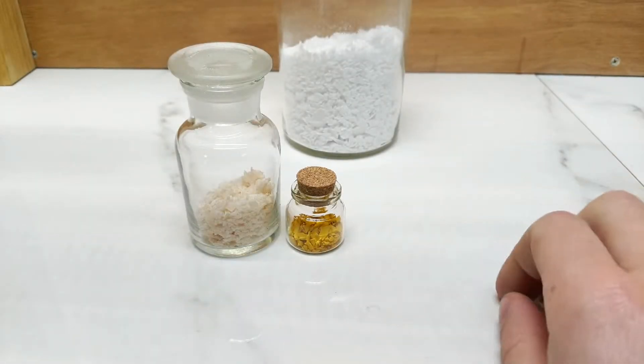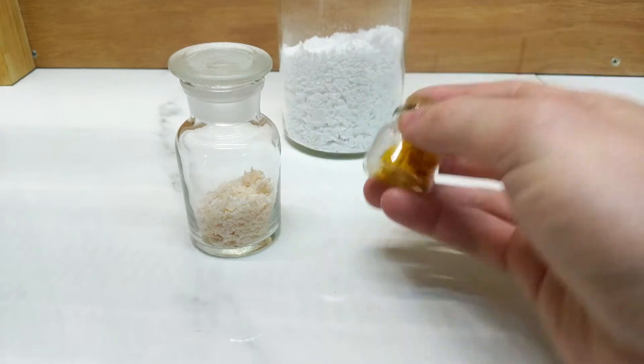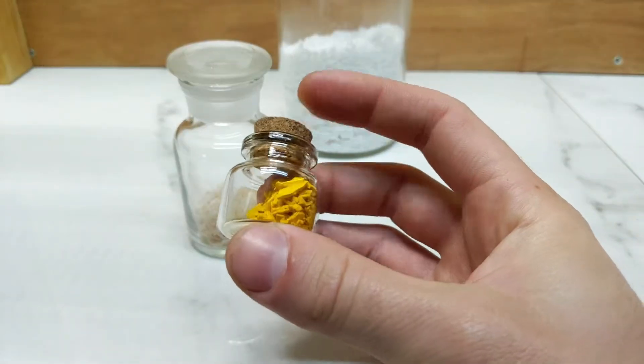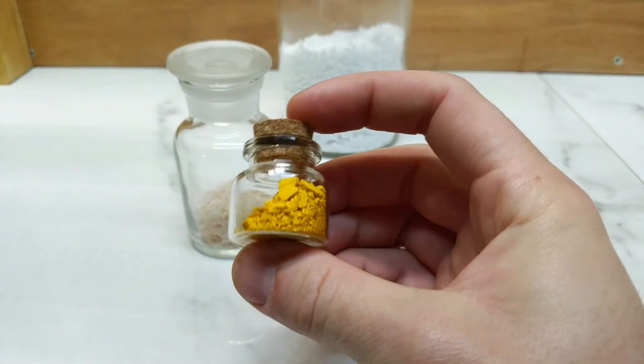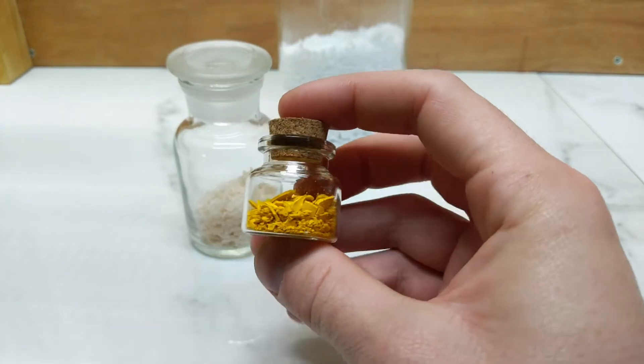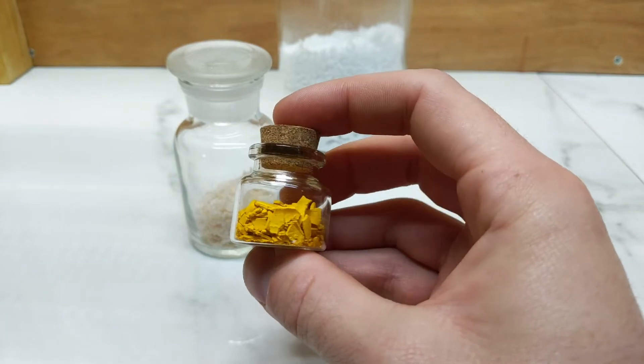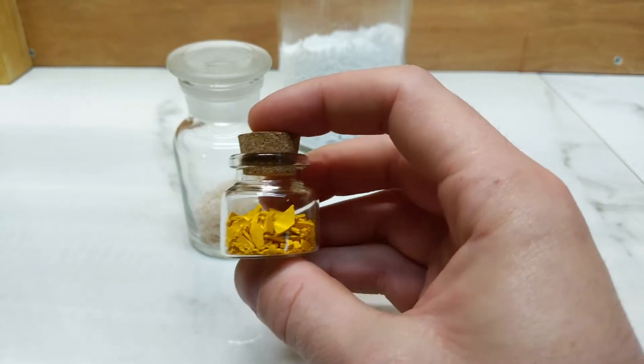Hello and welcome back to the Alchemical Arts. This is part two of the Chromate Pigments series. Today we're going to be taking this here, which was our chrome yellow from part one, which has just been dried. I haven't ground it up or anything yet because I want to take it to different stages now, which is what this part two is all about.